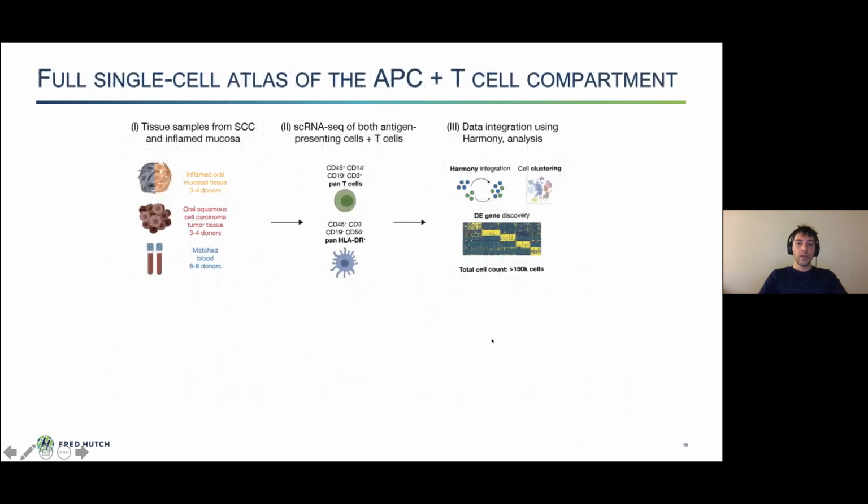When we tried to make sense of that data, we realized that our cytometry profiling was not digging deep enough, and that's where the single-cell RNA sequencing came in. And luckily, the previous speaker at this meeting gave a very good introduction to the 10x platform, which is basically what we used here for this approach.